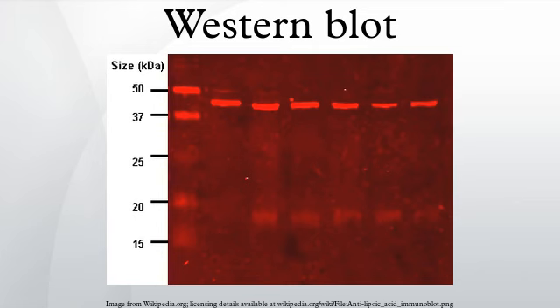An older method of transfer involves placing a membrane on top of the gel, and a stack of filter papers on top of that. The entire stack is placed in a buffer solution which moves up the paper by capillary action, bringing the proteins with it. In practice this method is not used as it takes too much time. Electroblotting is preferred. As a result of either blotting process, the proteins are exposed on a thin surface layer for detection.